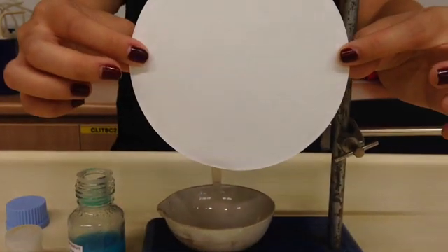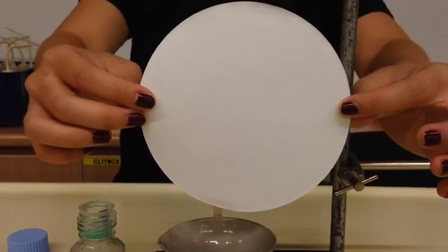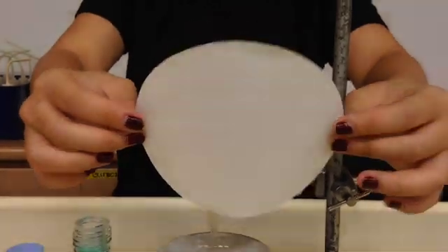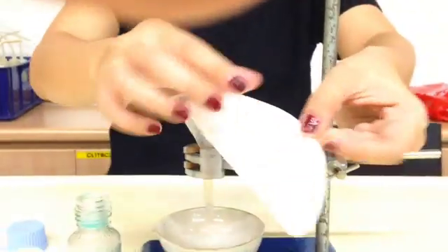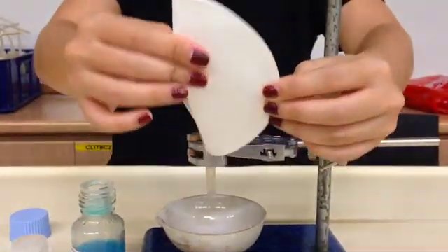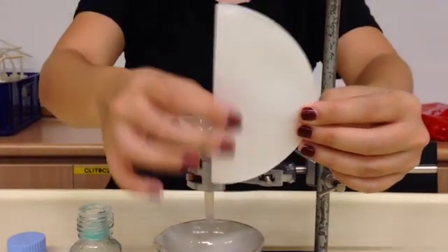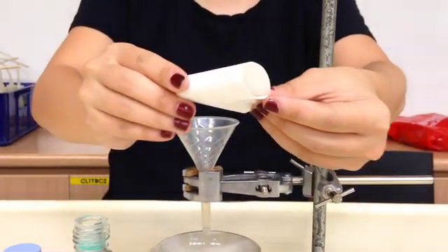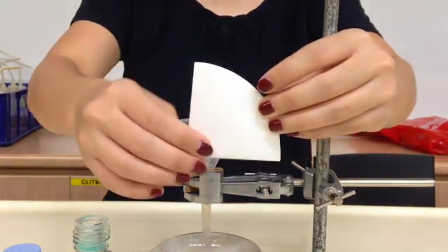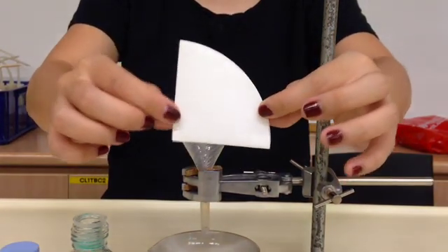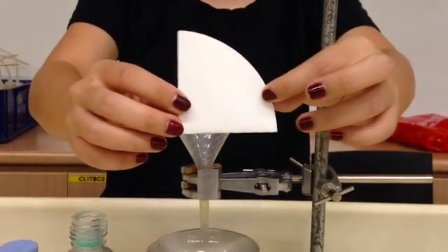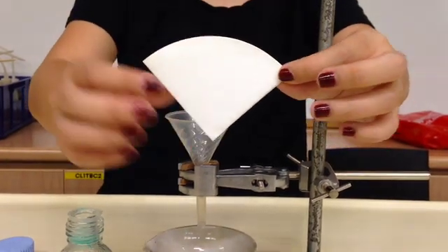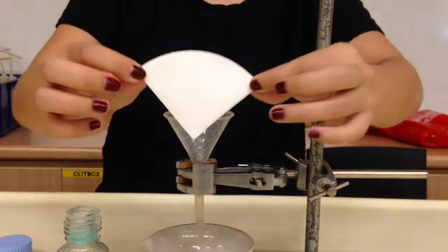So over here I have this piece of filter paper. The filter paper is round and some of you might not really be sure how to fold the filter paper, so firstly we fold it into half, then we fold it into a quarter. So your filter paper should look like this, a quadrant.